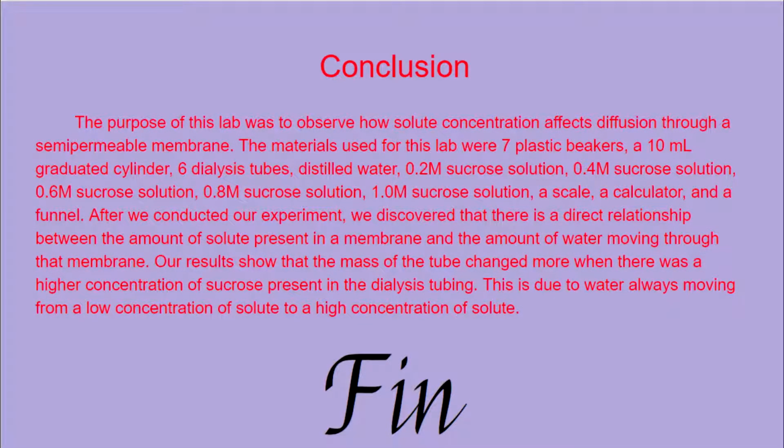The purpose of this lab was to observe how solute concentration affects diffusion through a semi-permeable membrane. The materials used for this lab were 7 plastic beakers, a 10 milliliter graduated cylinder, 6 dialysis tubes, distilled water, 0.2 molar sucrose solution, 0.4 molar sucrose solution, 0.6 molar sucrose solution, 0.8 molar sucrose solution, and a 1.0 molar sucrose solution, a scale, a calculator, and a funnel.